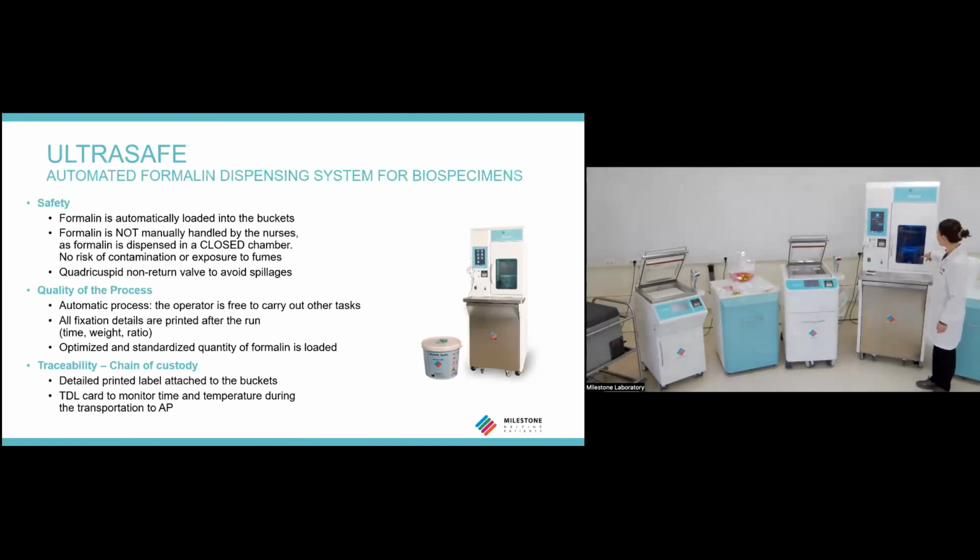A particular point is that for these cavities, when the operator is not using the unit, you can plan, for example during the night, to run a UV decontamination process. This is also useful against COVID decontamination. So now the loading procedure is done.